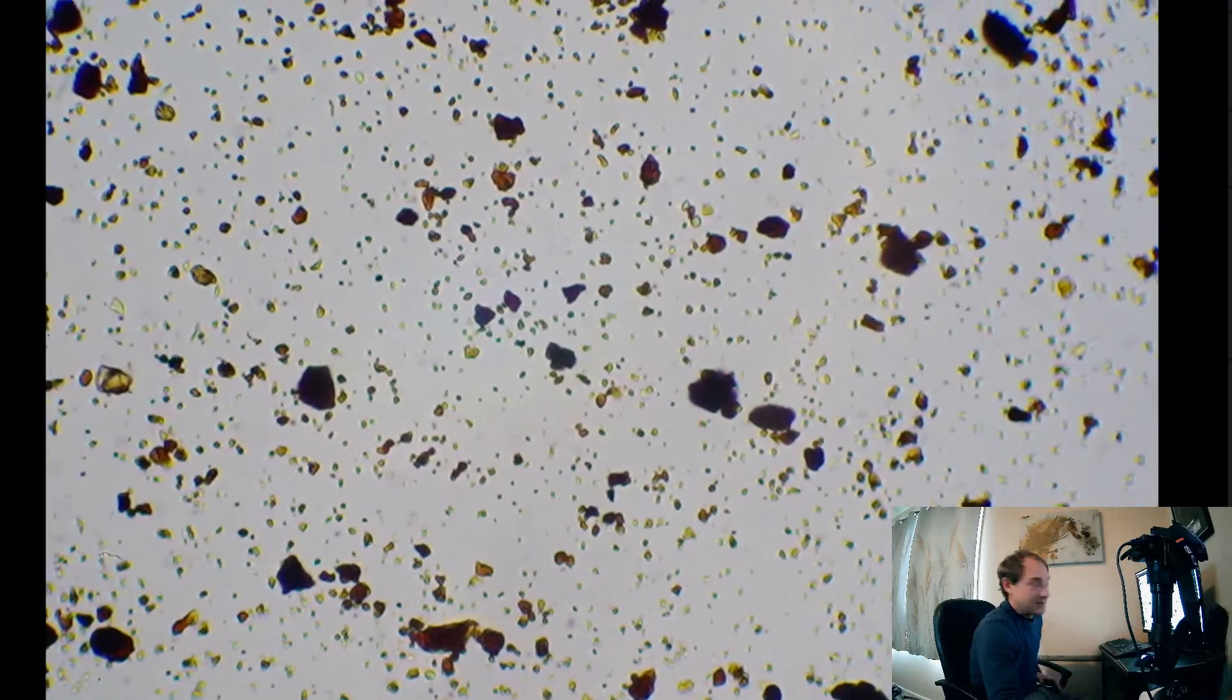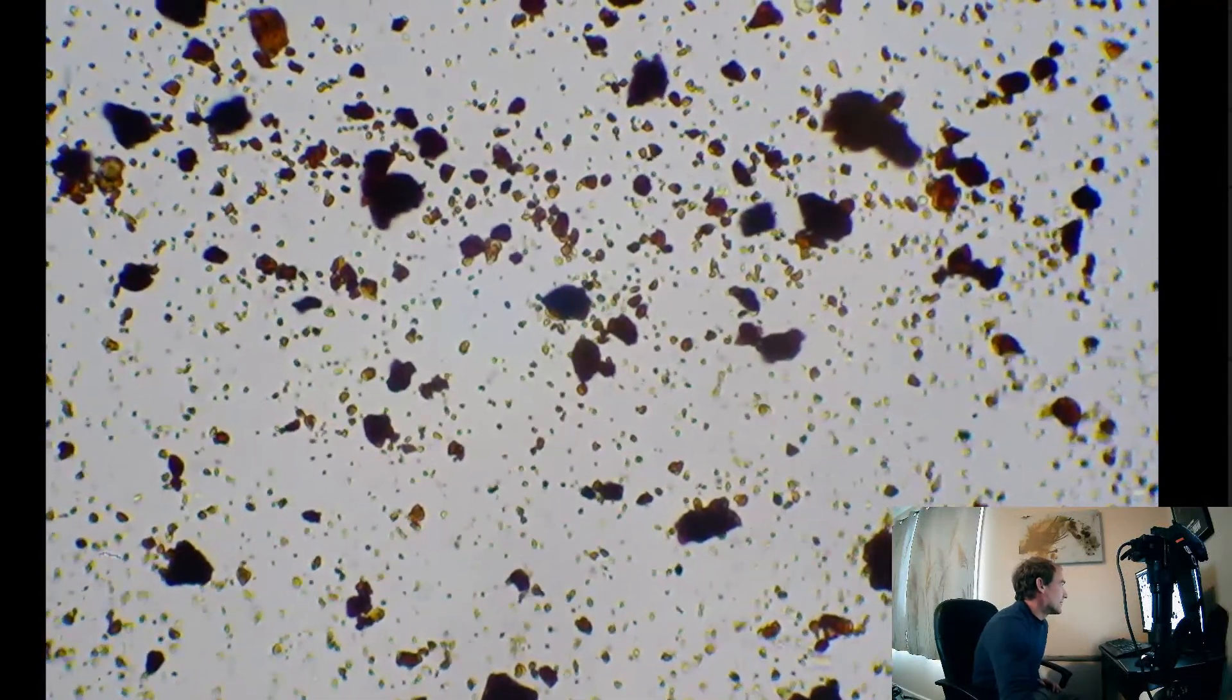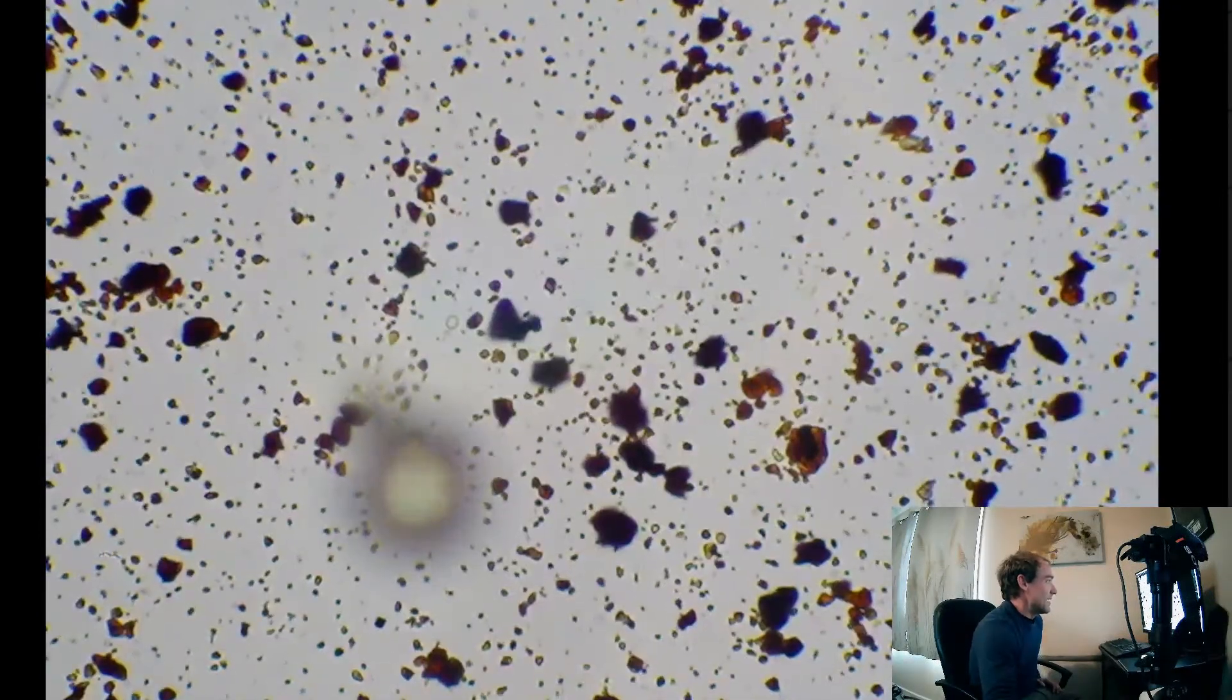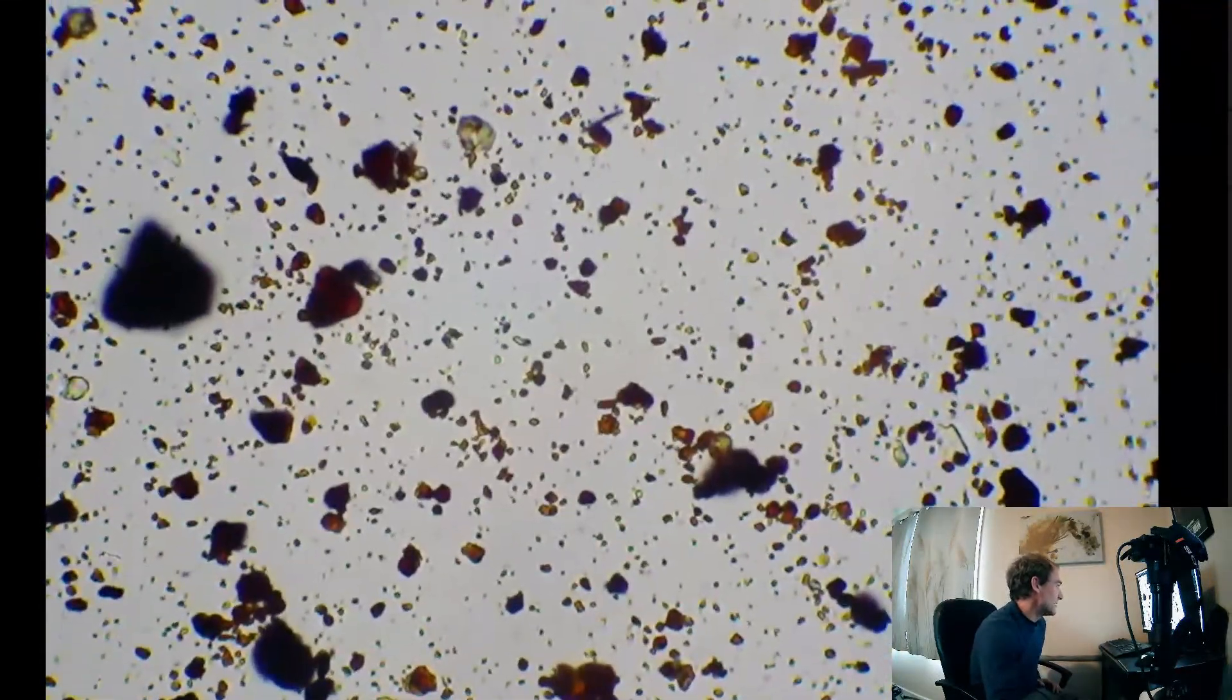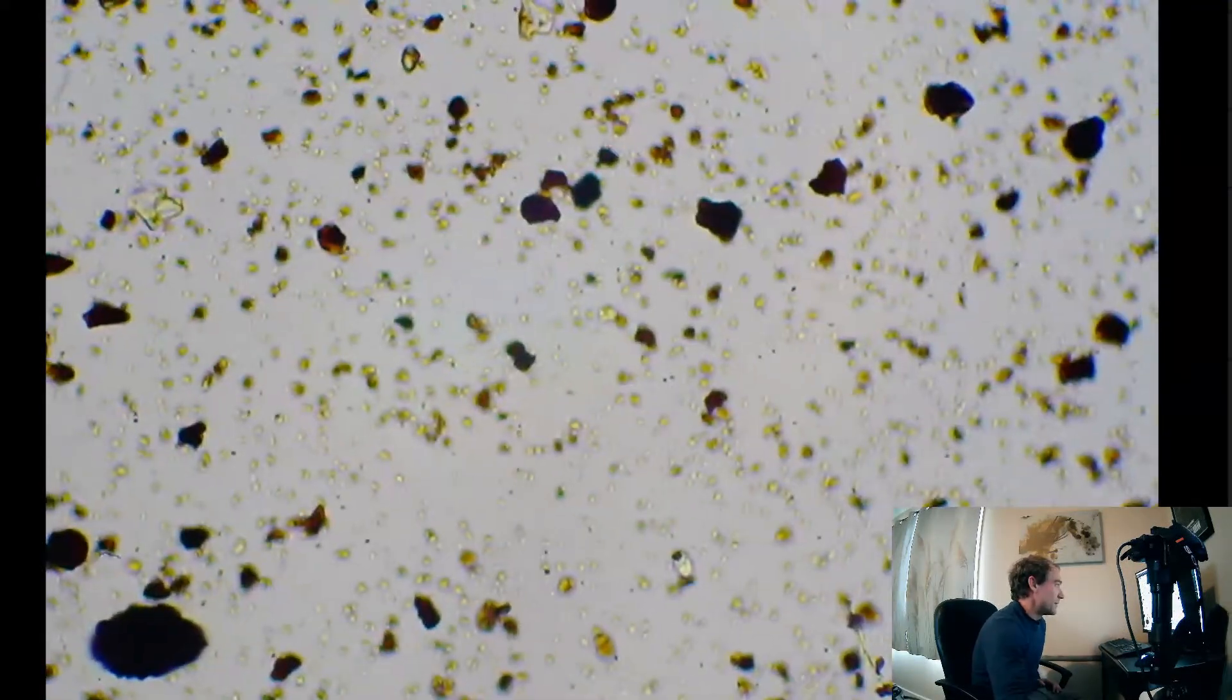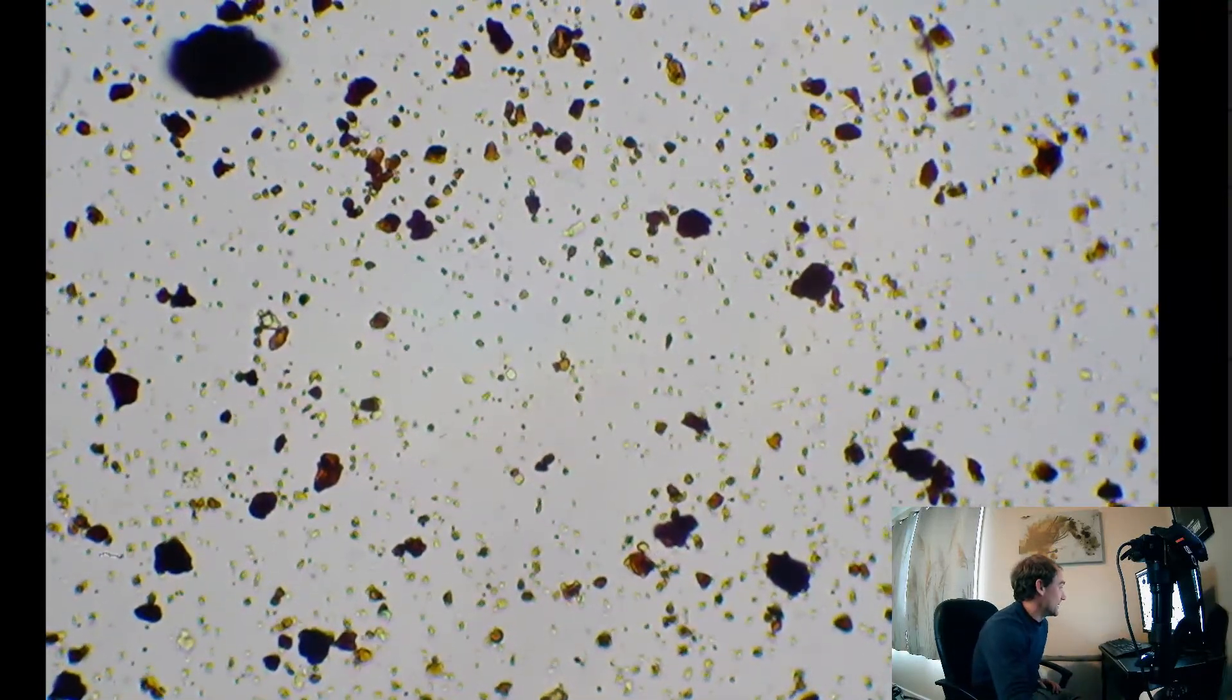Bacterial life anyway. Not seeing anything along the lines of spores, but it's not supposed to be a fungal inoculant of any sorts. It's just supposed to be a food and a microbial booster, but holy cow, for a microbial product this has a lot of microbes in it.